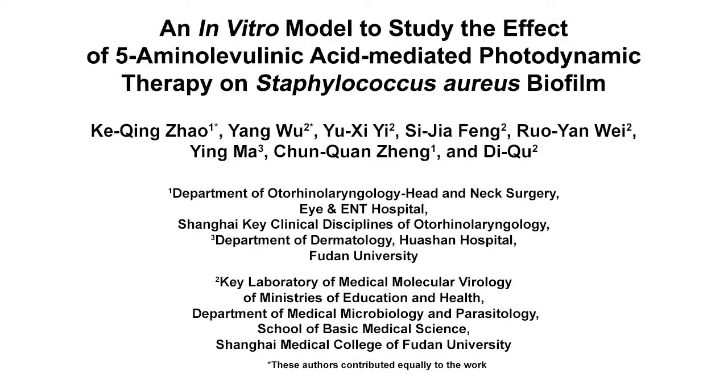The overall goal of this experiment is to evaluate the antimicrobial effect of 5-aminolevulinic acid, or ALA-mediated photodynamic therapy, on a Staphylococcus aureus biofilm. This method can answer key questions in the bacterial biofilm field of how photodynamic therapy might be used as an alternative treatment for controlling biofilm infections. An advantage of this procedure is that it has the potential to be used for other bacteria with minimal adjustment.